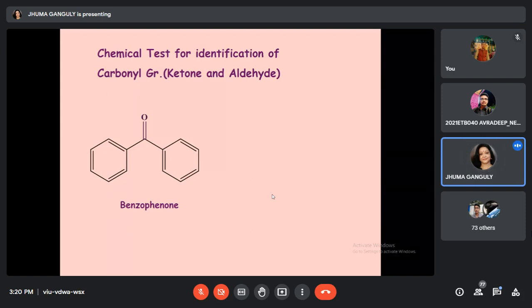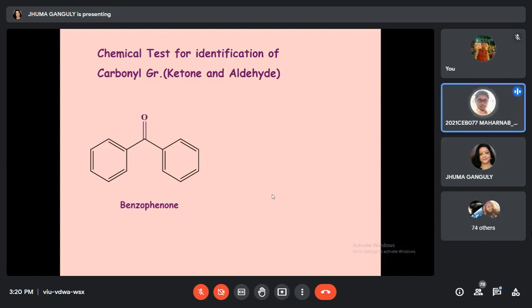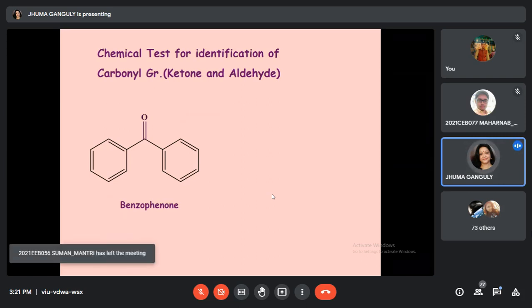After the reaction, it will form a yellow color solid. Ma'am, hydrazone. Yes, the hydrazone moiety will form, by a condensation reaction with elimination of a water molecule, H2O. So we are taking benzophenone here, which is a good material that gives a nice result, that we provide for the initial known sample testing.